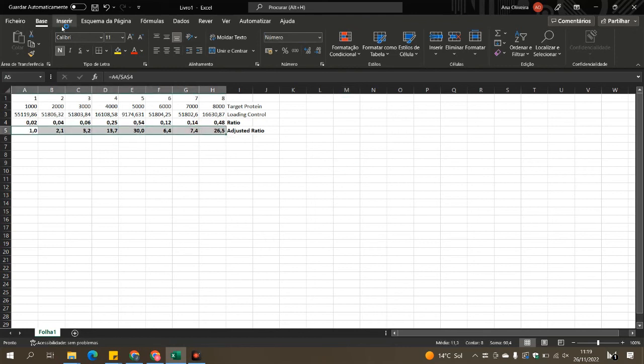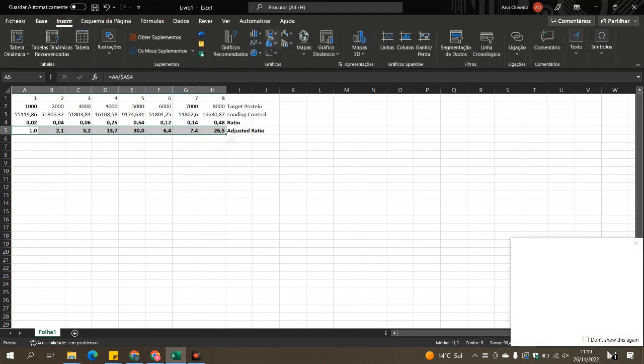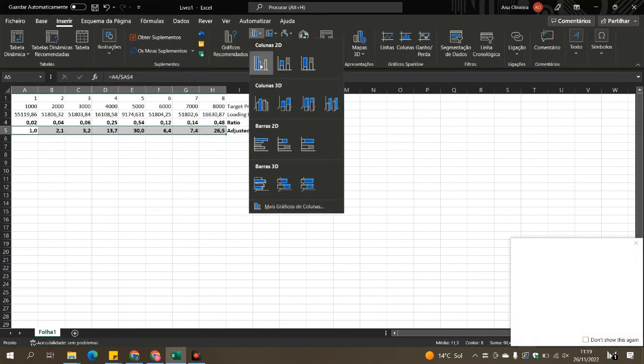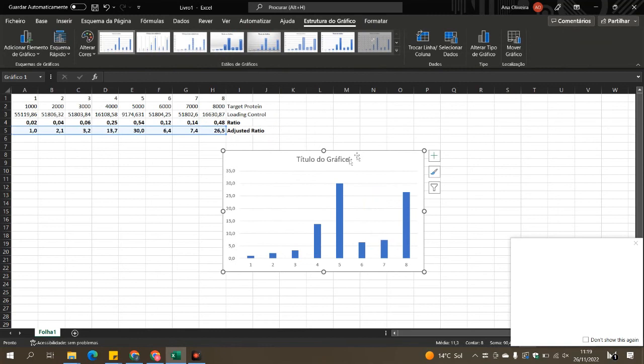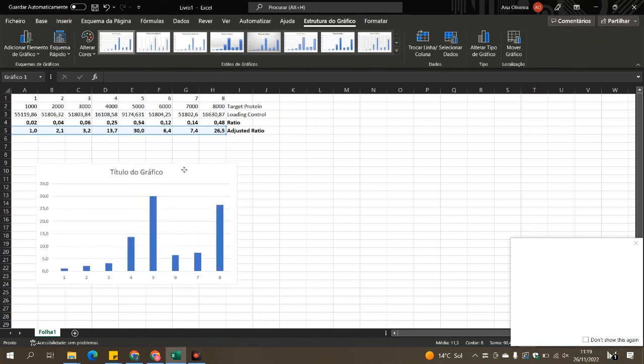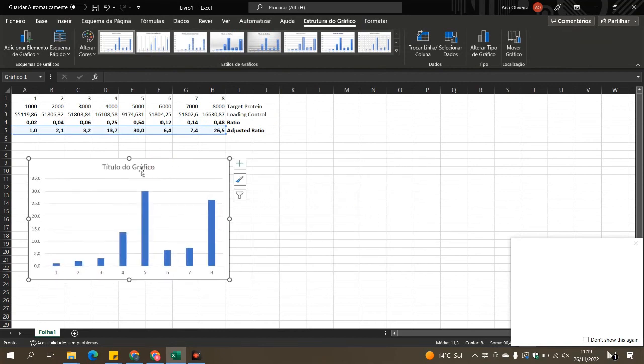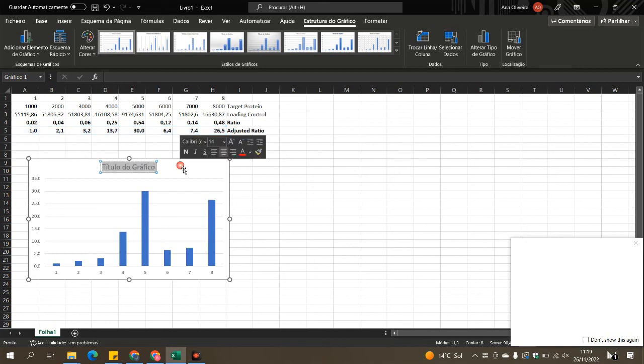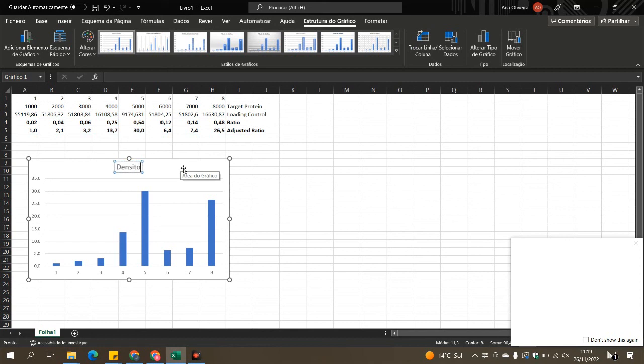But you can then plot them into a column graph, a column chart in this case, so you can see which treatments increased or decreased your target protein relatively to the control one.